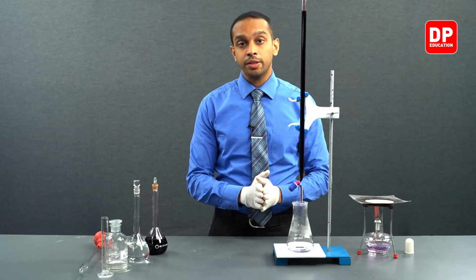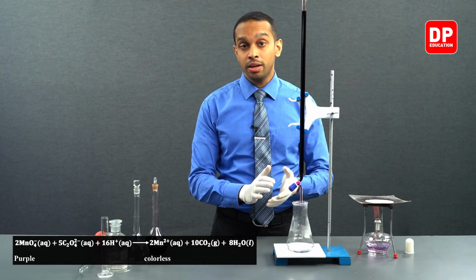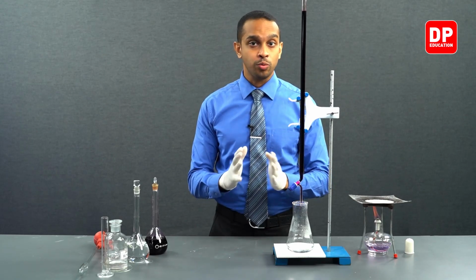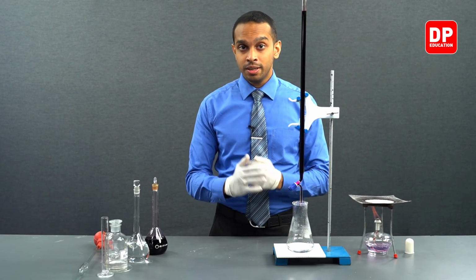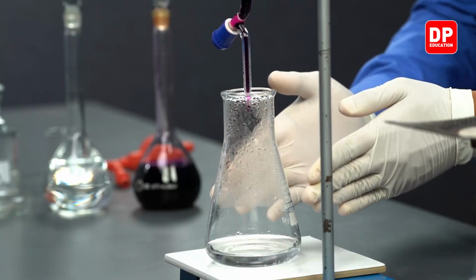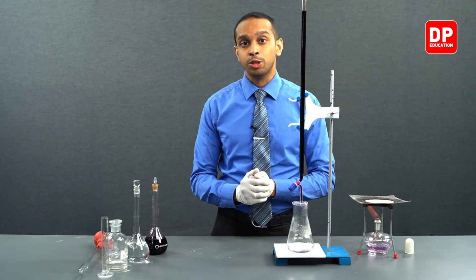When we are doing a titration like this, we can see when we add a little bit of potassium permanganate how long it takes for the color of the potassium permanganate to disappear. If the color disappears quite fast, that means we are not very close to the end point. If it takes a little while longer, that means we are nearing the end point. But when it comes to this particular titration, it could mean the temperature of the solution also is not enough. At that point, we can try to heat it up again and see if the color disappearance takes place at a faster rate.